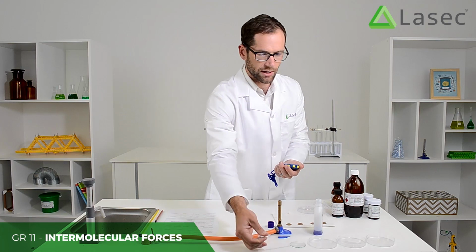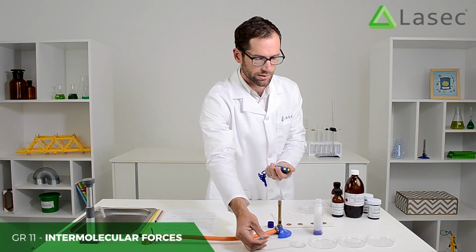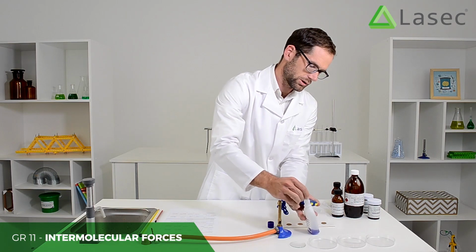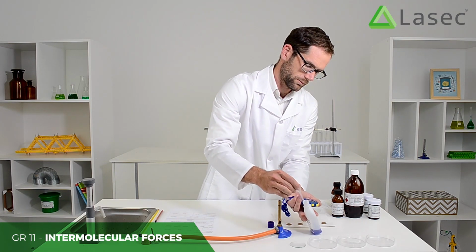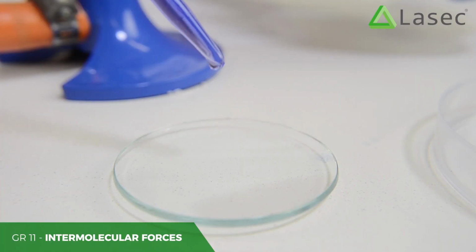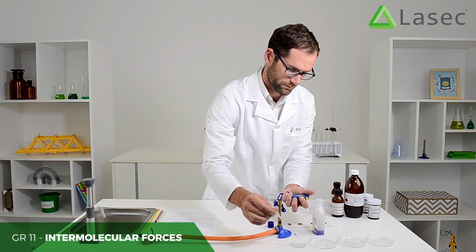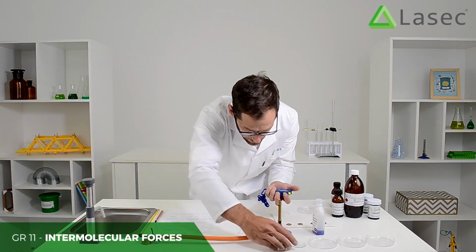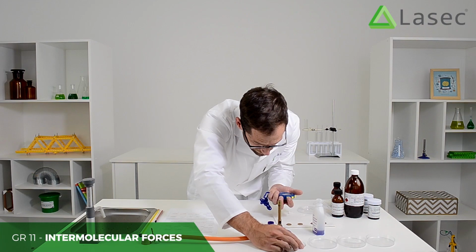And I've got a watch glass here because the nail polish remover would damage the plastic petri dish. I'm going to observe it.